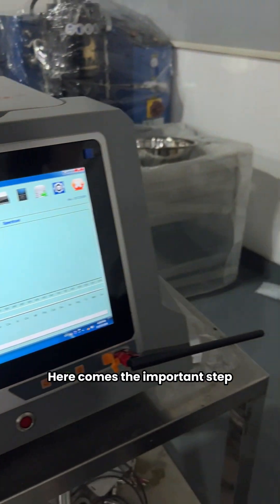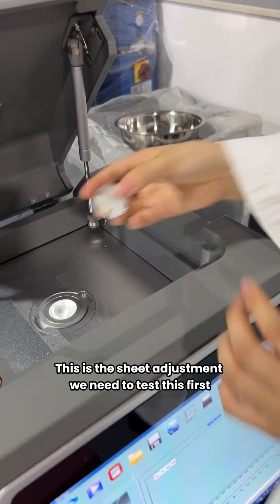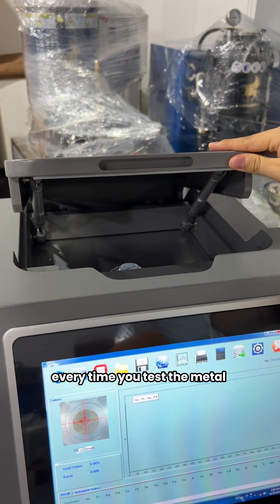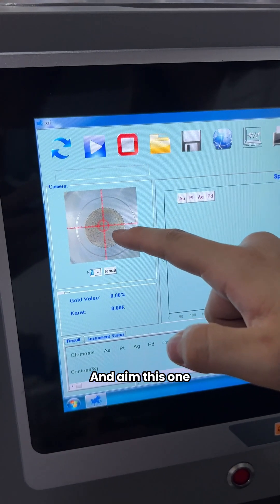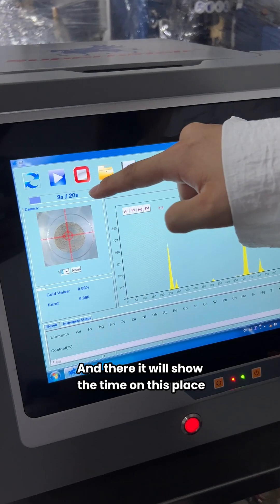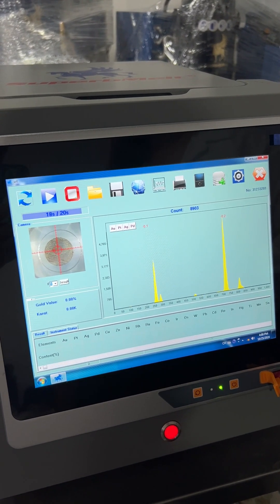Now comes the important step — this is the sheet adjustment. We need to test this first before we can test our metal. Every time you test the metal, you need to close the door and do the sheet adjustment. It will show the time in this area — each sheet adjustment takes about three to four minutes.